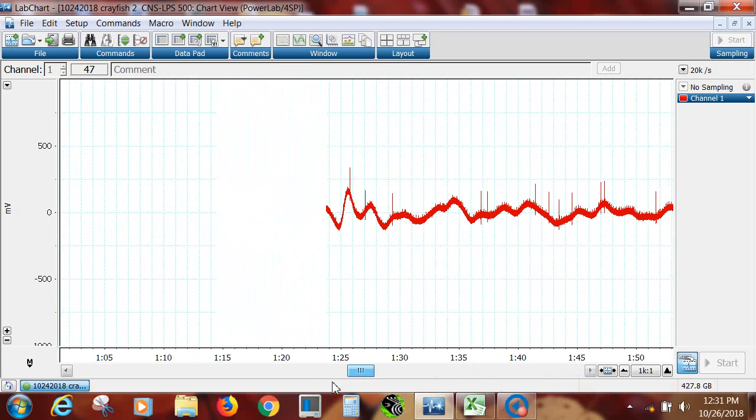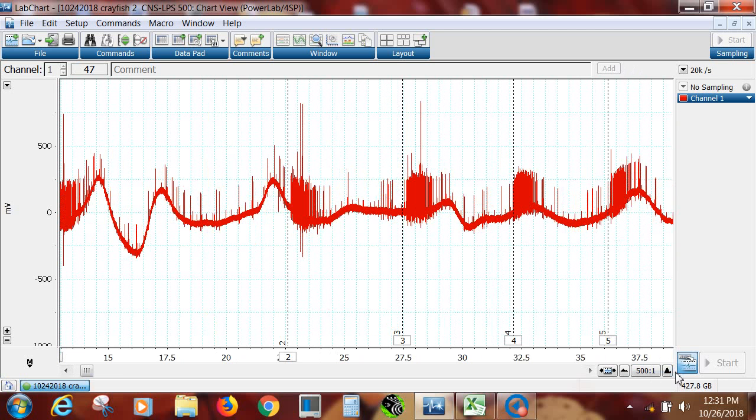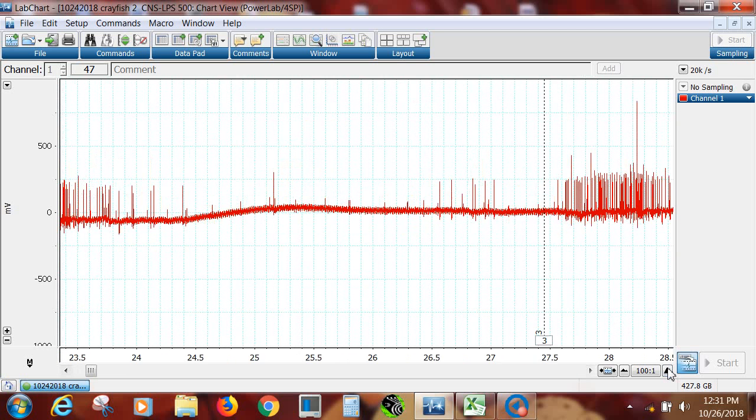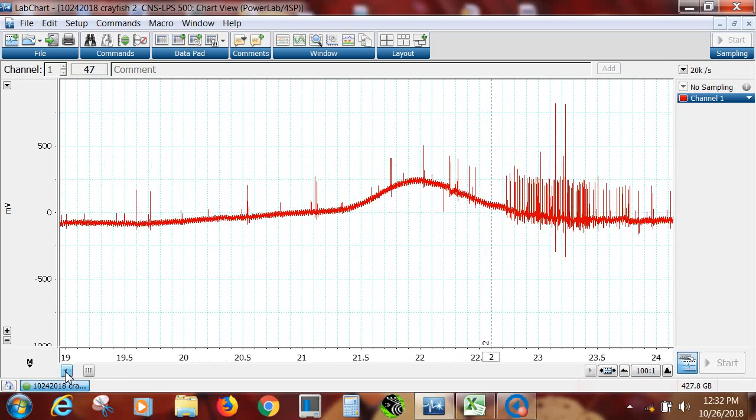All right, to analyze the data, what we need to do is try to count these spikes. And as you see right there, you can't count them, so we have to spread it out a little bit. All right, so we're spreading it out. And let's go to that first one. There's number 1, there's number 2.